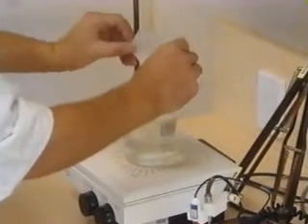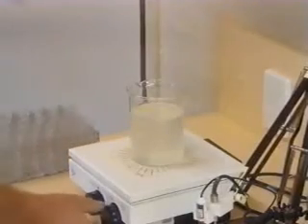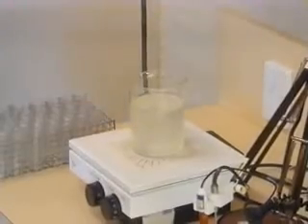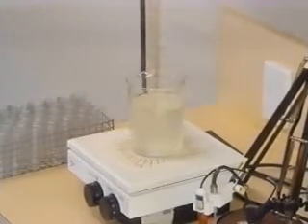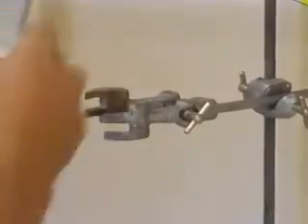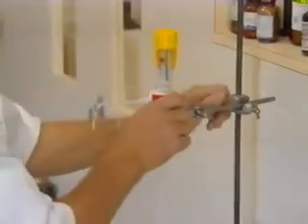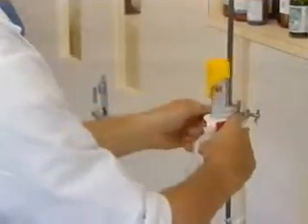Otherwise, the gelling agent will settle to the bottom of the beaker, resulting in a batch of medium which is not homogeneous. This means that some containers will have a lot of gelling agent and some will have very little in them. Once the gelling agent is added and dispersed or dissolved thoroughly, the medium can then be dispensed into culture vessels.